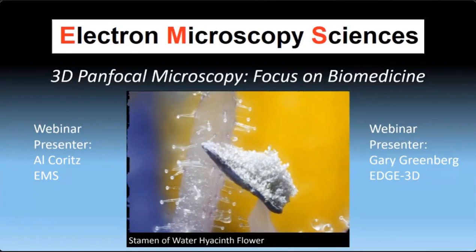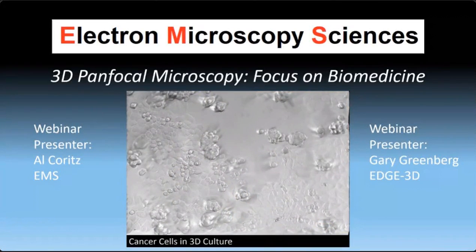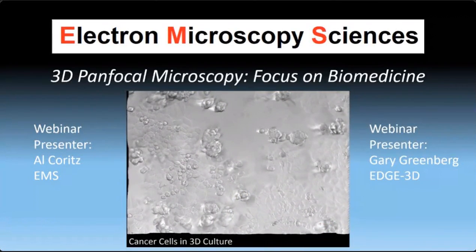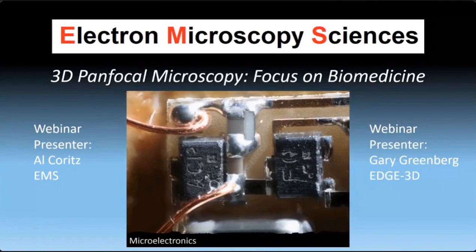Thank you so much, Alan. Thank you all for joining us today. I really appreciate it. What you're looking at on this beginning screen is just some various shots taken with the system, the panfocal 3D microscopy system.